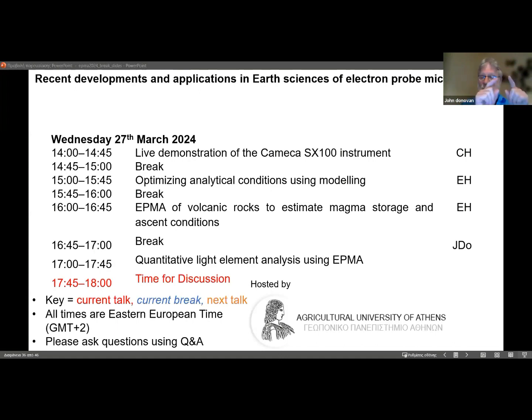So you can get the titanium from each spectrometer, and that's useful, and make sure you do the blank correction, because each spectrometer will have a different blank correction, and it depends on the orientation of the PET crystal actually to get that secondary Bragg diffraction that causes those little negative holes in the continuum. But when you aggregate them after you've done the blank correction, then you now are getting like a giant spectrometer, and that giant spectrometer now has much better sensitivity, and basically each doubling of the counts improves the detection limit by the square root of 2, as we know.